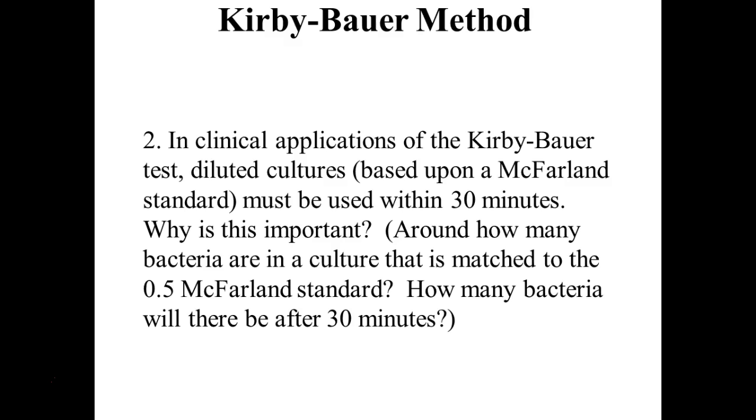But once I prepare this, if I match it up well to that turbidity standard, or 0.5 McFarland standard, about how many cells should that be? Anybody find that answer? 1.5 times 10 to the 8th cells per milliliter. So, after 30 minutes, are there still going to be only 1.5 times 10 to the 8th? If you let it sit around for 30 minutes, an hour, E. coli can copy itself in 30 minutes. You could have double the amount of bacteria.